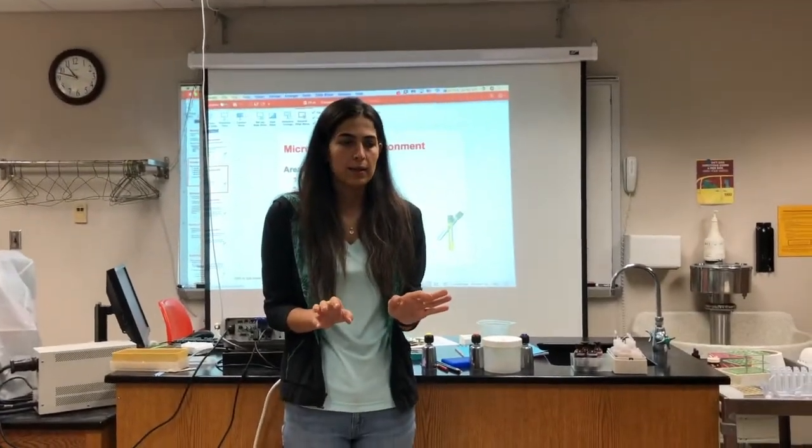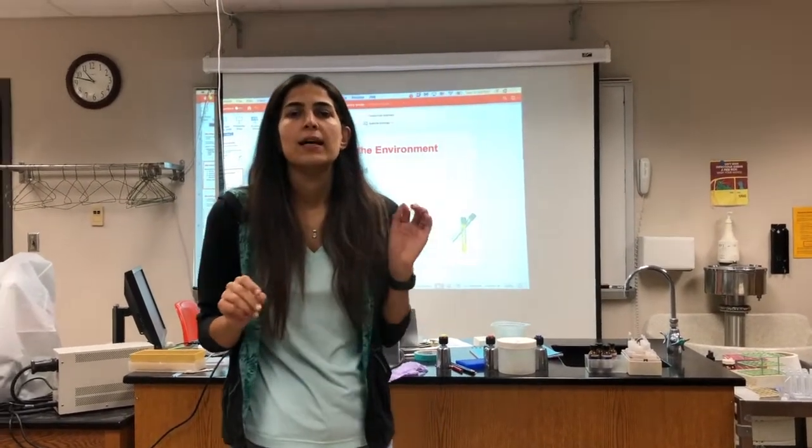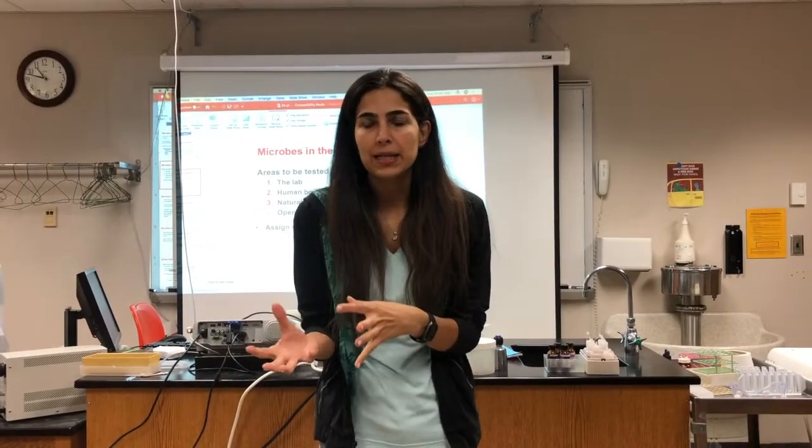After doing that, we will move all 4 samples to the incubator. This is the 30 degree incubator. When you put your samples in the incubator, you provide a condition for microbes to grow.